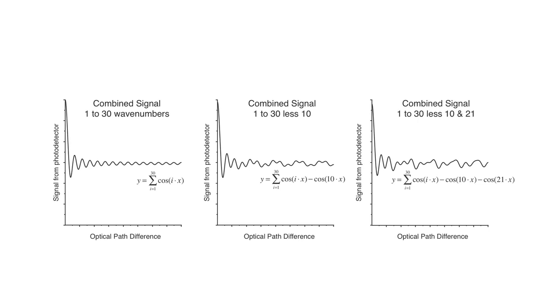Well, that was 5. Let's do 30. Now, you might say, but Barry, how are we going to do 30? Well, you just use Maple or any math package. Just add them up and plot it. I just plotted this function here. So I did, basically, i is 1 to 30. So basically 1 to 30 oscillations per period of distance, which I'm imagining being a centimeter. And there we go. Look, the big center peak.